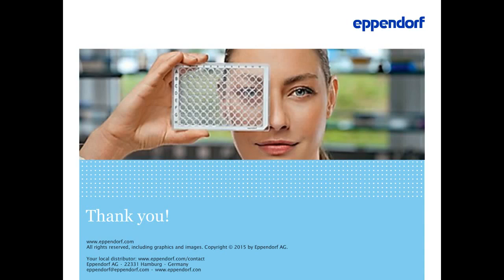Most of the data you show refers to tubes and plates. What about tips? Might they also have some influence on the experiments? Although the contact time of samples with the material of the consumables is indeed shorter in the case of pipette tips than it is in tubes or plates, they may also have an influence on the experiments. Some examples were provided in the presentation. Erucamide is a slip agent from pipette tips and has been shown to inhibit G protein coupled receptor assays, or a dye-solubilizing agent inhibited mitochondrial respiratory chain enzymes. Very sensitive analytical methods like HPLC or MALDI also may be affected by leaching from tips, and there are many more examples in the literature. In general, the more sensitive the assay or the method, the more likely leaching from pipette tips may influence it.